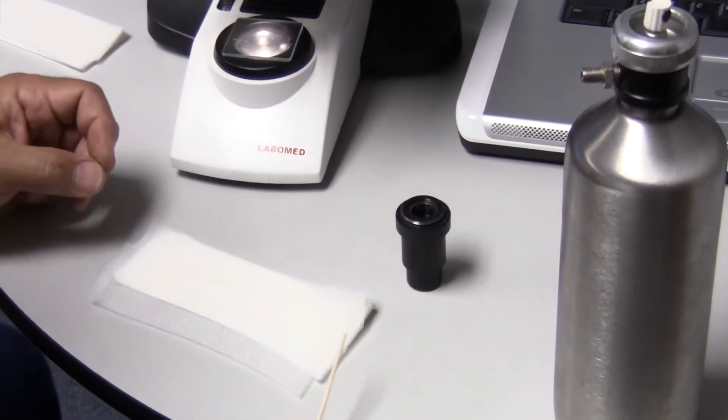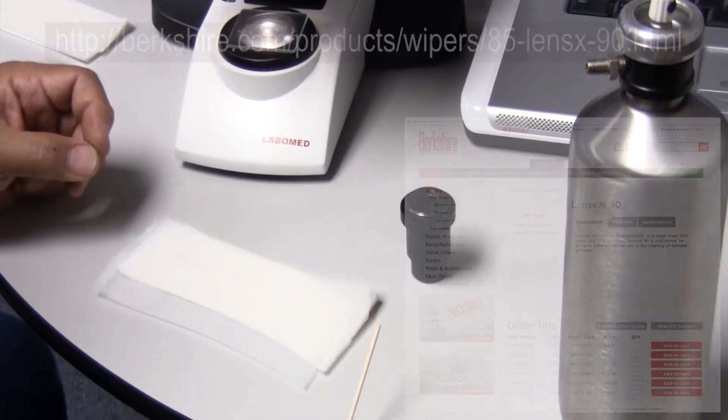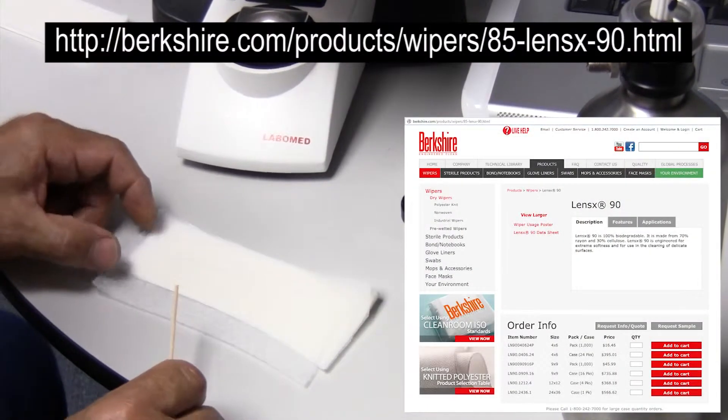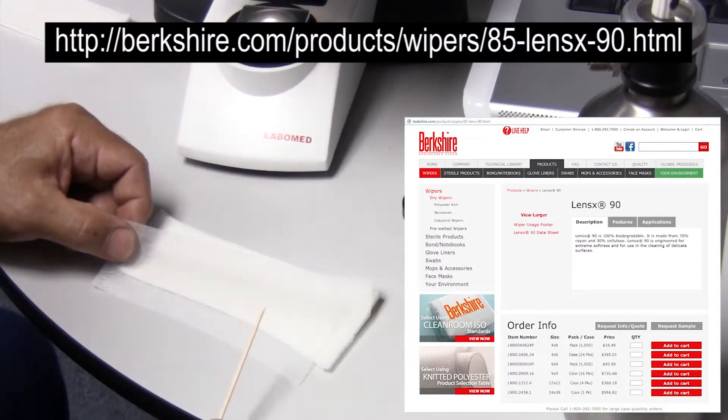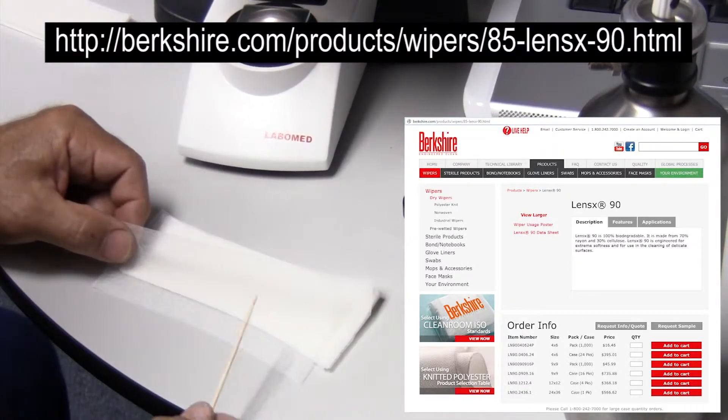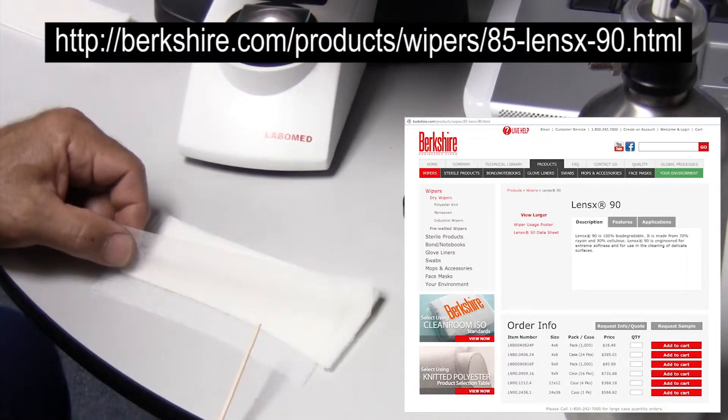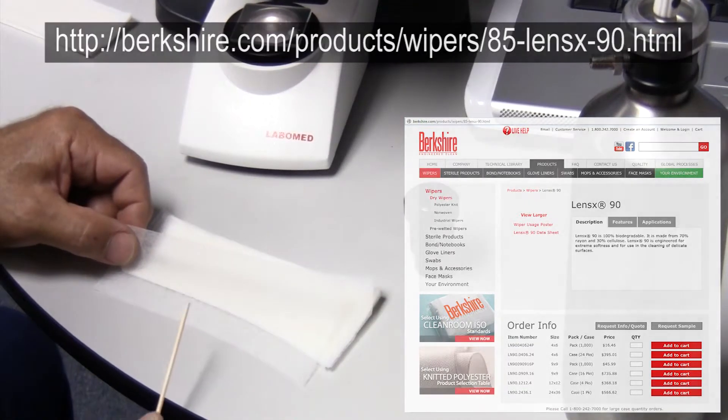The paper I use is called Berkshire LensX 90. This is a special, primarily rayon fiber. It doesn't leave the dust and lint behind that you'll get from either, like a tissue, a kim wipe, or even a cotton swab, which is probably the worst thing to use.